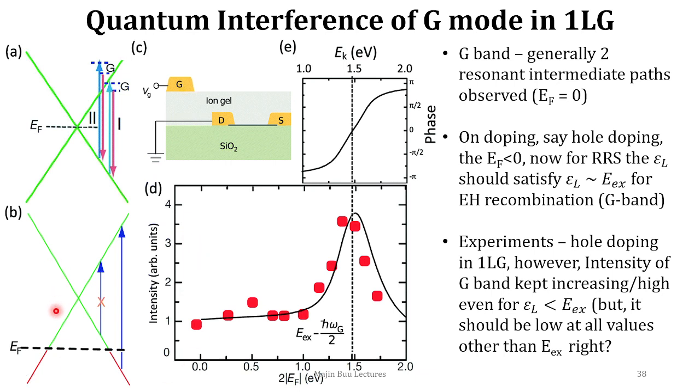But what was done in the study was they doped the structure with holes, resulting in a dip in the Fermi energy level. Following this, an energy greater than the band gap difference was provided between the valence and the conduction band.